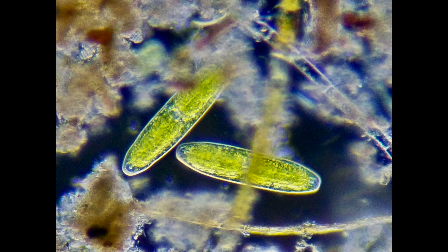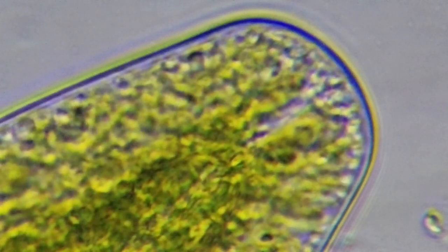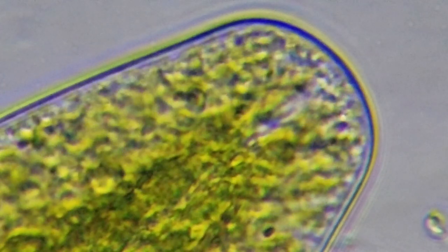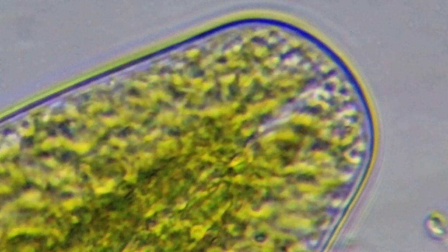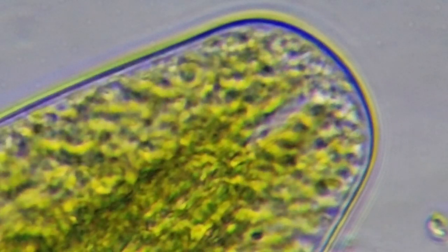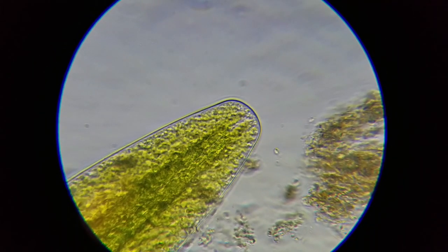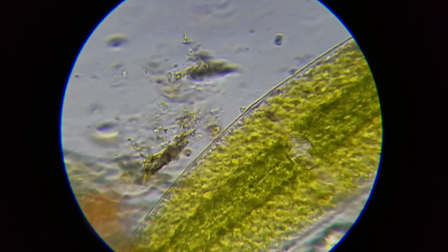Right here we have two beautiful diatoms. This is at a thousand power and you can see these organelles moving inside the diatom around the edges, floating in the cytoplasm. Diatoms are responsible for about 20% of the oxygen on earth, so about every fifth breath you take comes from a diatom. They're very important — they come in all sizes, shapes, and colors, and they are quite amazing.